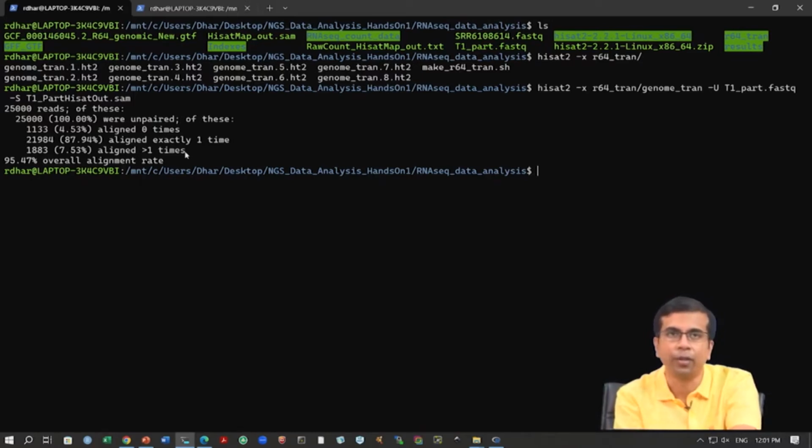What are these tools that we can use to make use of the read data that align to multiple positions in the genome or in the transcriptome, and how do you utilize those to actually estimate transcript abundance? Because discarding them means we are maybe underestimating the abundance of some transcripts, and counting them for multiple genes or transcripts might lead to overestimation of the abundance of some transcripts. So, this is a very important problem, right. It is not just for genome sequencing. Here the count, the number of reads mapping to each feature, is very important.